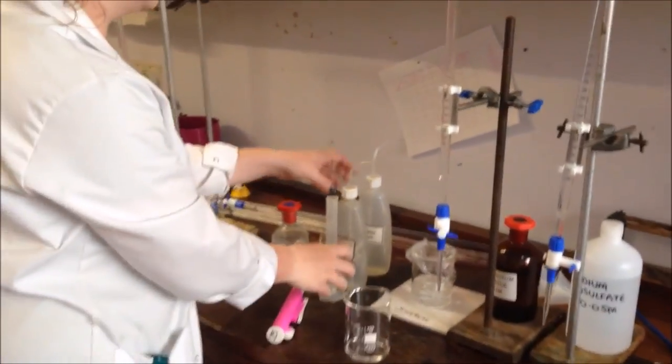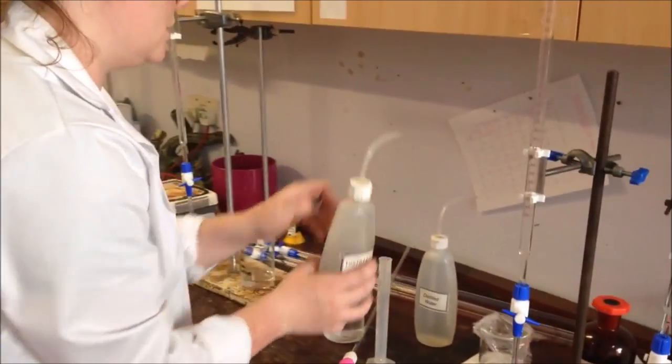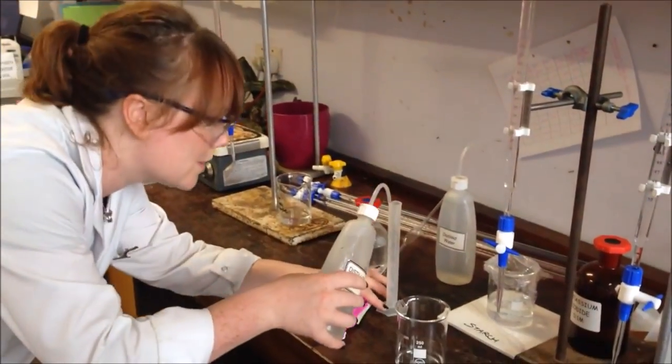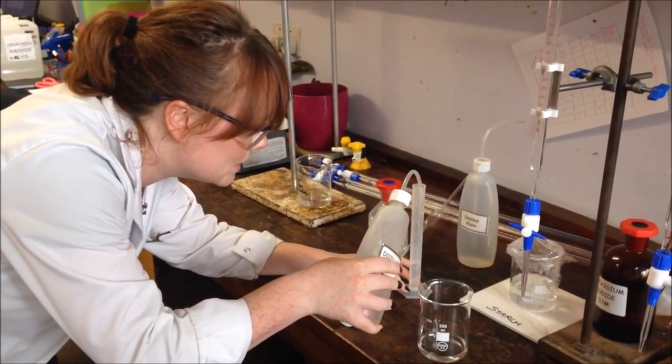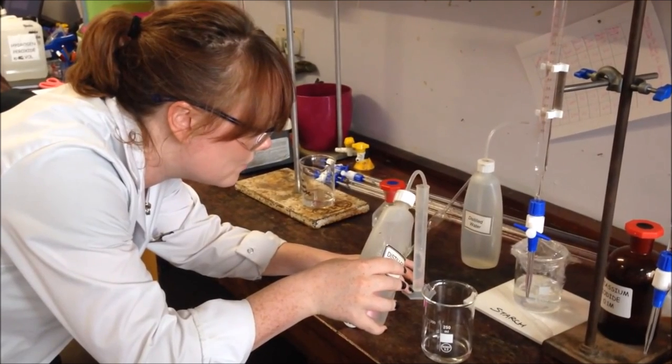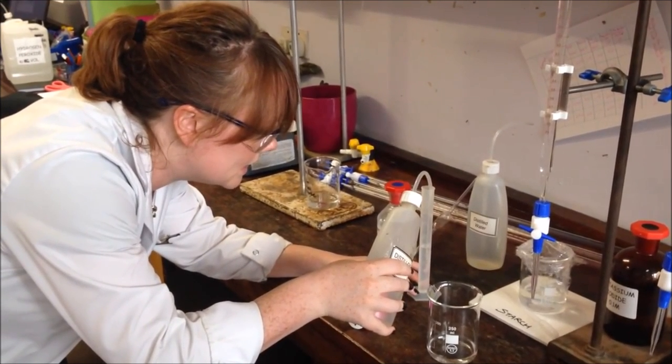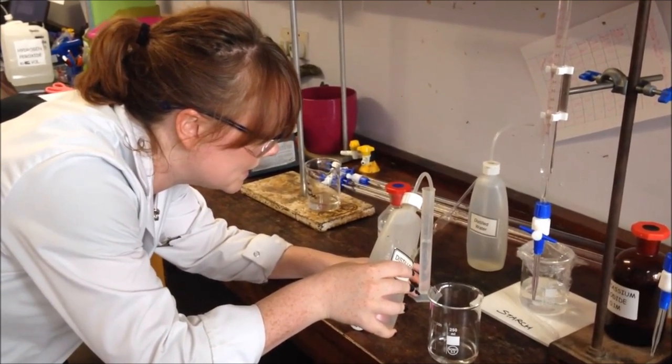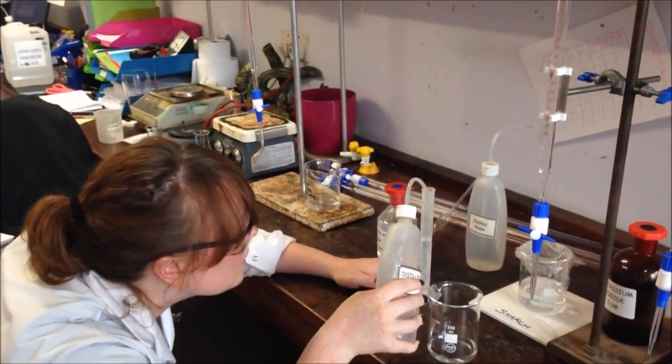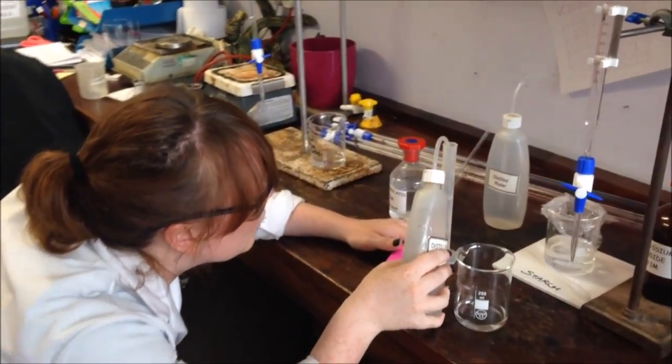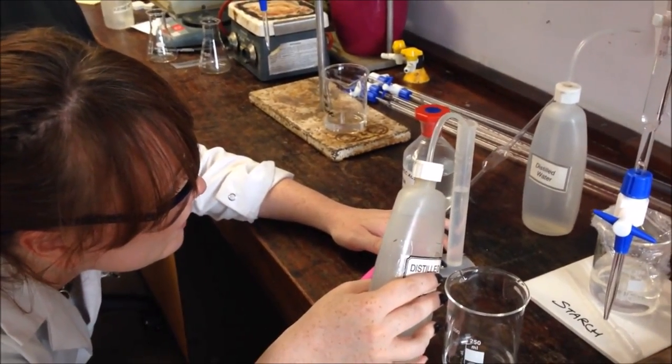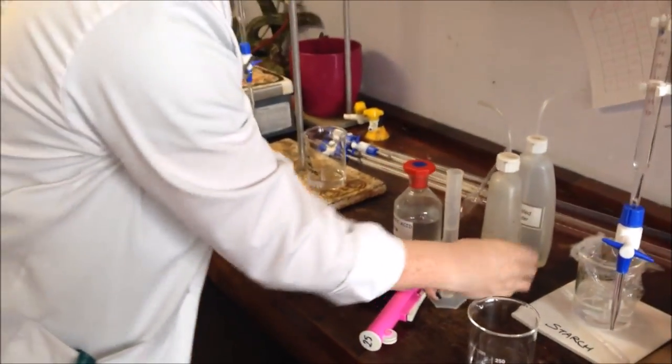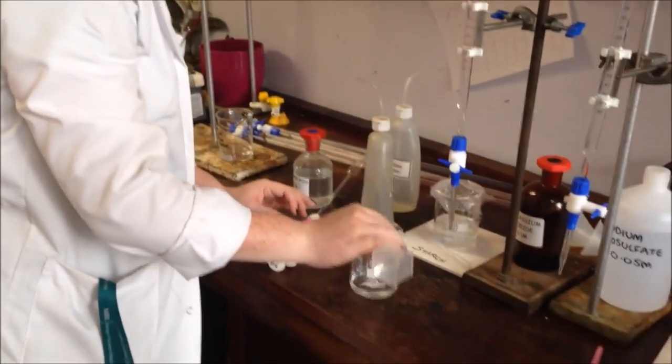Next, into my flask, I need to have 20cm³ of distilled water. I'm going to do that with a dropping bottle into a measuring cylinder, so I'm just going to measure that roughly until I get close to 20cm³. And that can now go in there.